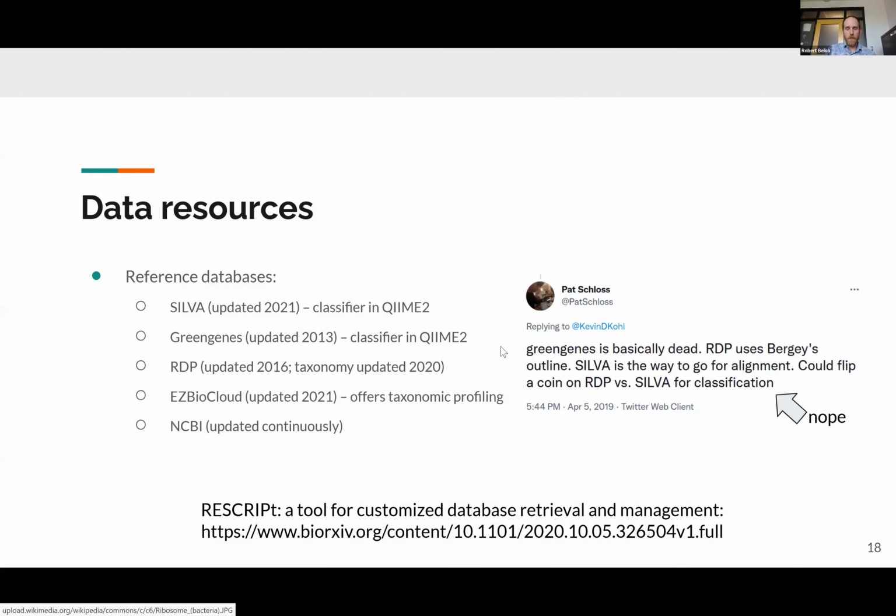Okay, so the second part is really more about a means to an end, right? Sequence data, sequence retrieval, and quality control. Quality control is a thing we have to do because DNA sequencing is messy, right? It's error prone, you get truncation artifacts, you get systematic errors. Things can just go wrong for whatever reason.